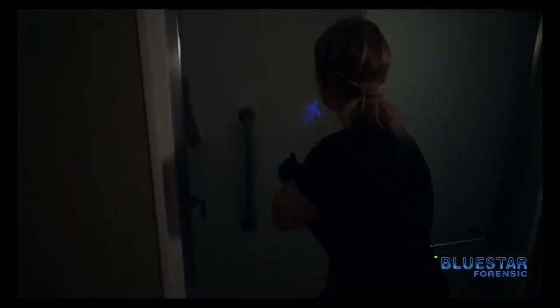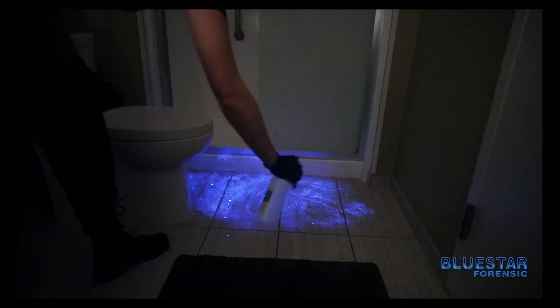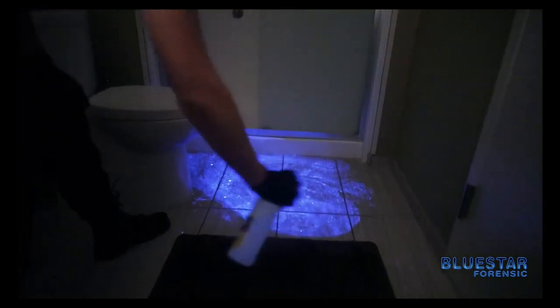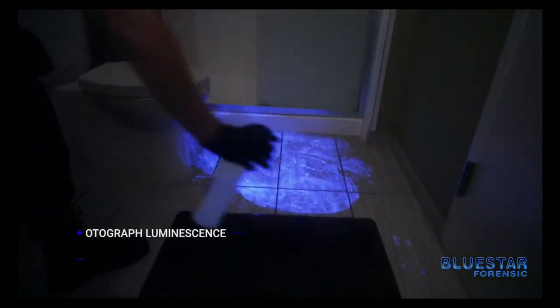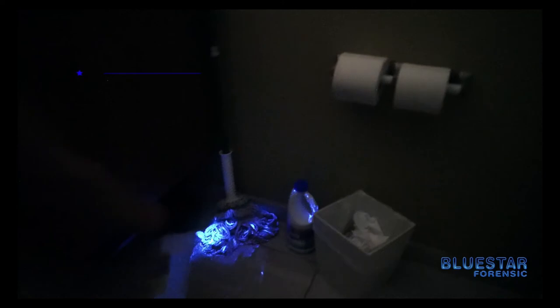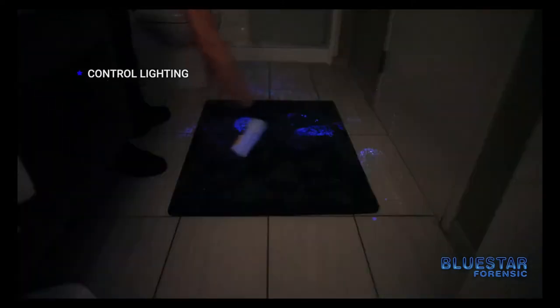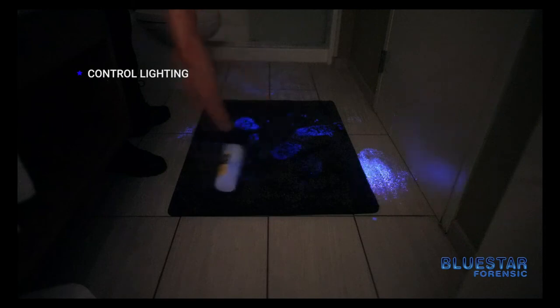Once you observe the luminescence from Blue Star it should last about 30 seconds to two minutes. At this point you would test the luminescence with a blood presumptive kit. As you can see, the chemical luminescence is now visible. At this point you'd want to photograph it and also test the area. When using Blue Star you do want to control the lighting in the environment that you're in, because it is a lower light glow.